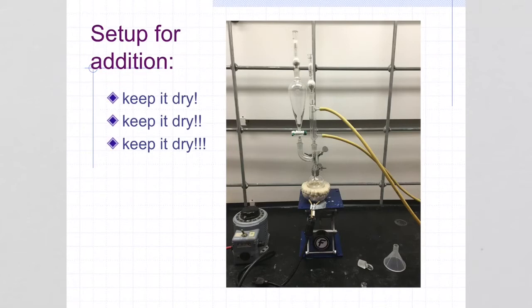It's exactly the same. The only thing that is different is this week we won't be using the heating mantle, we'll just be using an ice bath. Also, one of the things that's different from the drawing is here you can see the calcium chloride packed drying tubes that keep the reaction from being a closed system, but they also help dry out any air that might come into the reaction.